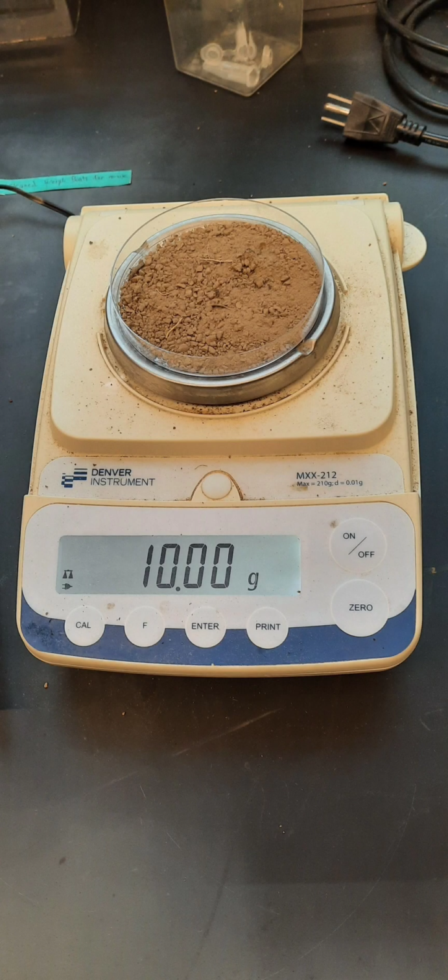Here's how that looks. This triggers cryptobiosis within the microbial population and allows for more efficient preservation and handling. We then measured 10 grams of soil and transferred it into a petri dish. We then crushed the remaining granules of soil that were large, as you can see on the left afterwards.